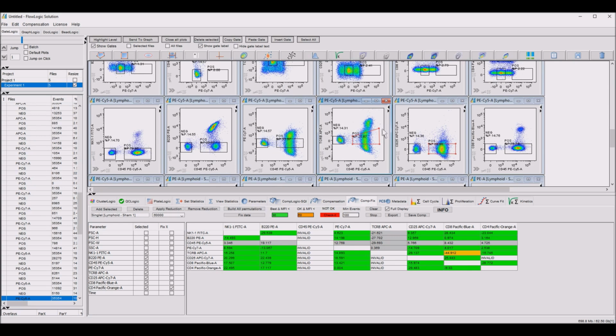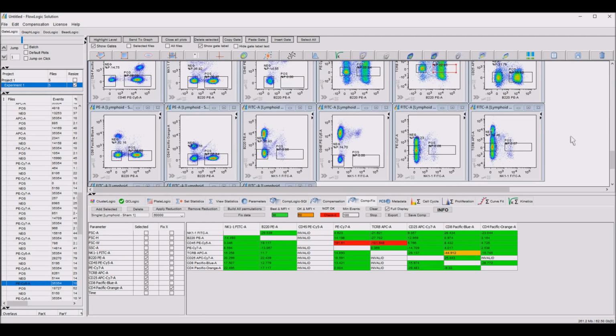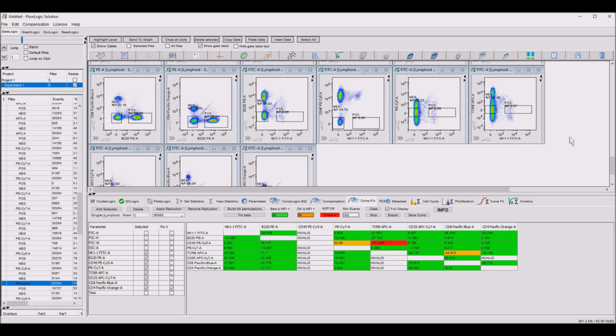Here we have a spread, so we can use the funnel strategy, and you can see again, we set up our funnel, and the value for positive, the delta value, changes immediately. You check all your gates, happy with the gate, you can start the fix.